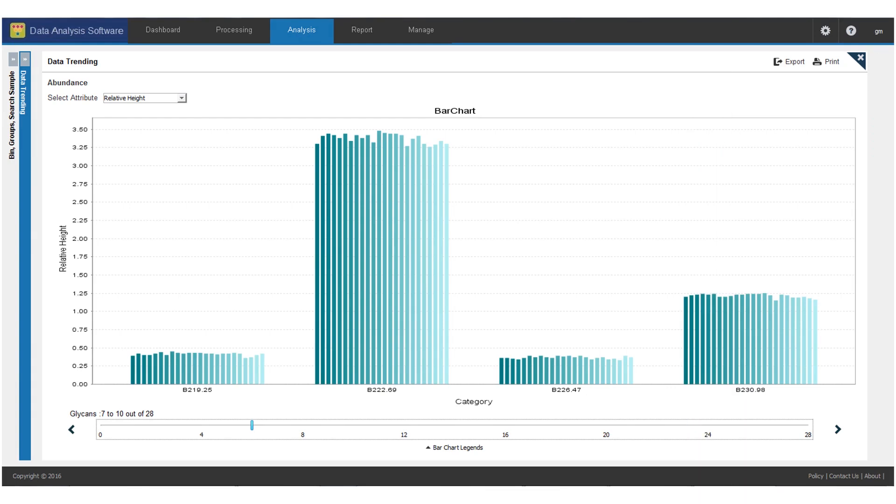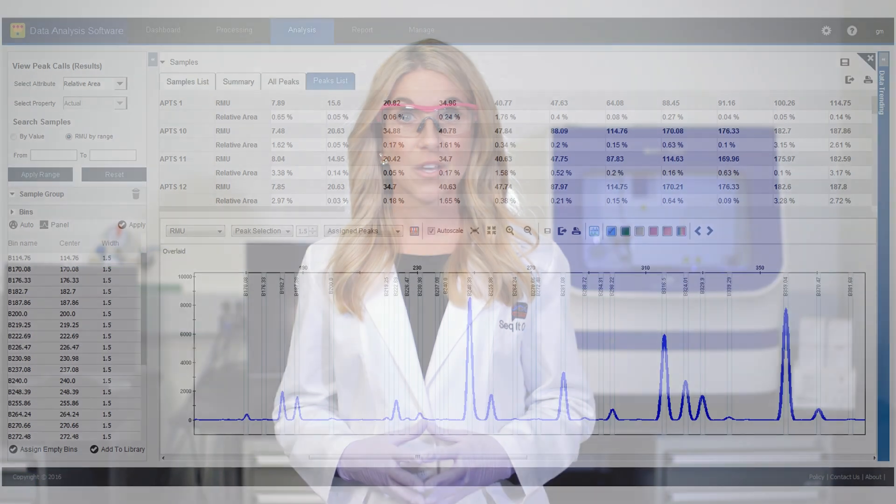Glycan Assure has simple and intuitive software that provides data trends and the ability to analyze data for 96 samples within one hour. The data acquisition dashboard provides easy access to instrument status and setup. Using this step-by-step workflow, you can create your favorite experiments and directly report or export your data.